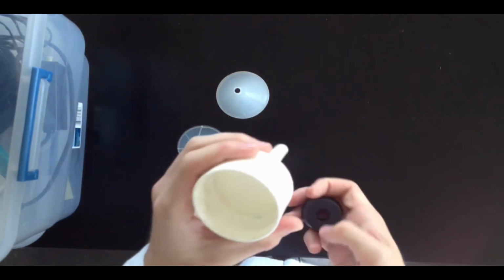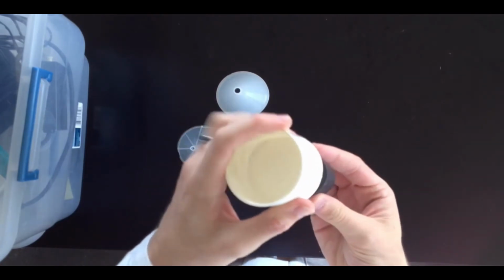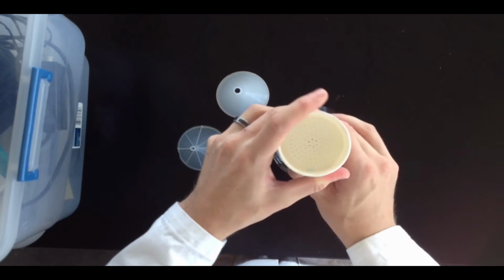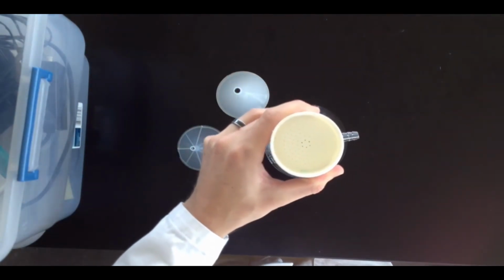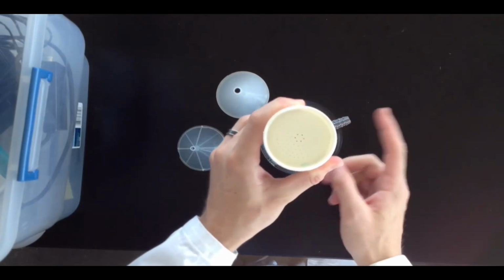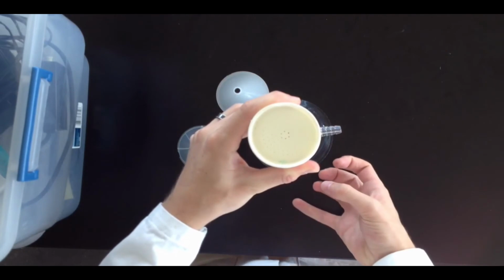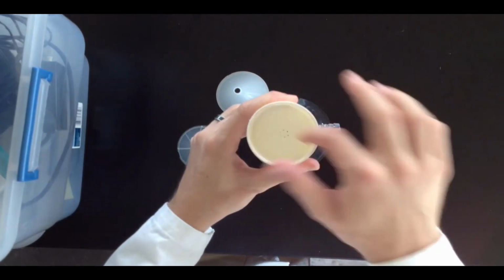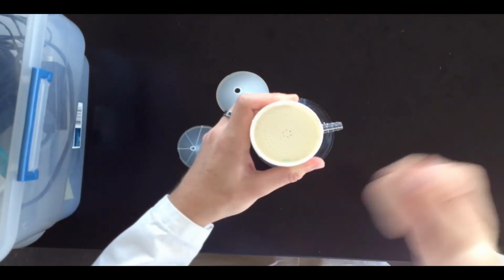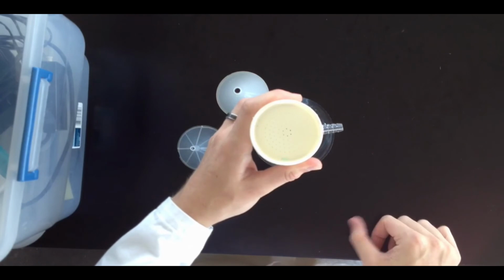The purpose of this funnel is for filtering mixtures of solids and liquids. So what we can do is, once it's all put together, we can put it in the top of a filter flask, put a piece of filter paper right in there, and pour a mixture of liquids and solids over top of the Buchner funnel after starting vacuum in the filter flask. What that'll do is it will pull the liquid through into the filter flask, and the solid will be left on top, and we can then scrape out the filter paper with something like a spatula or a rubber policeman and separate the solid from the liquid.